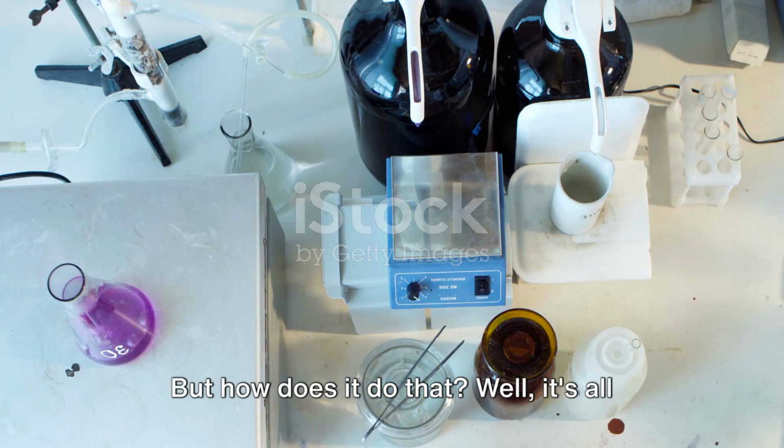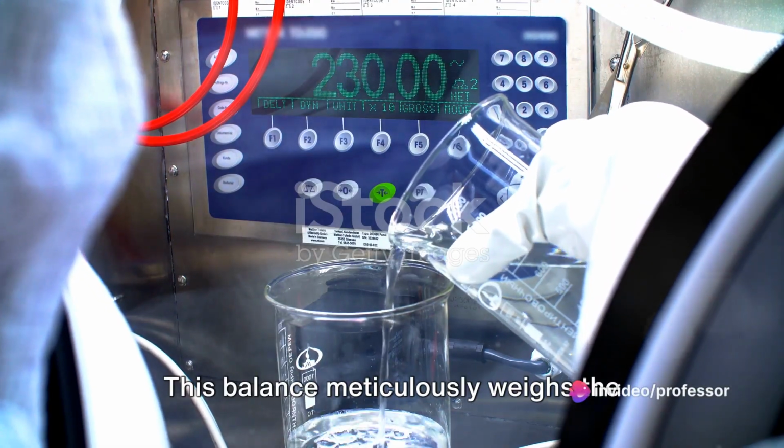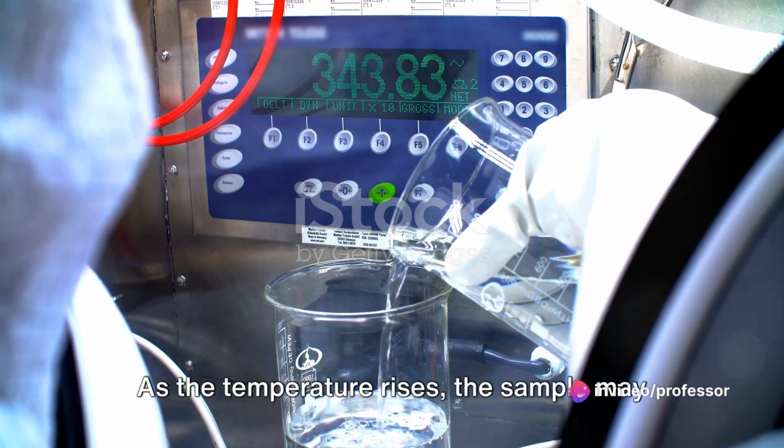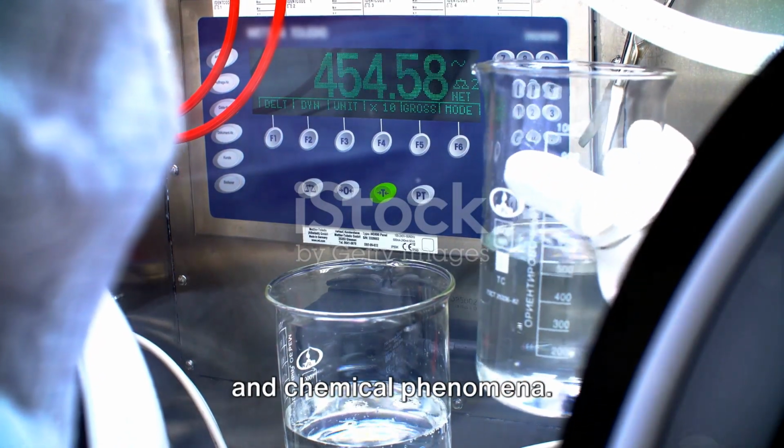But how does it do that? Well, it's all about balance, a high-precision balance to be exact. This balance meticulously weighs the sample as it undergoes a controlled temperature program. As the temperature rises, the sample may lose or gain mass due to various physical and chemical phenomena.